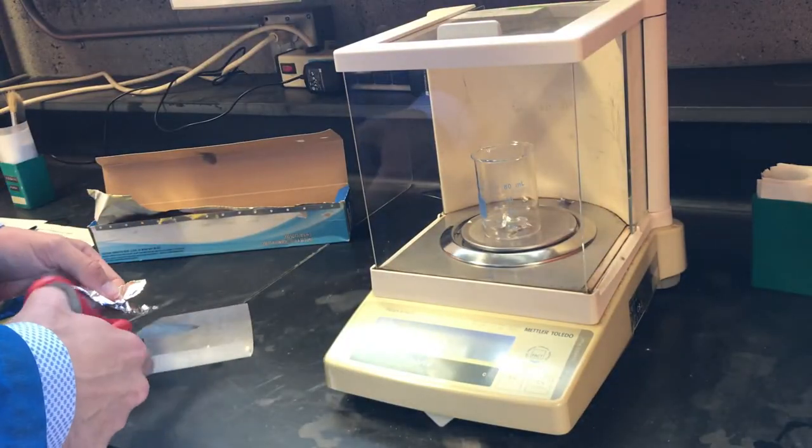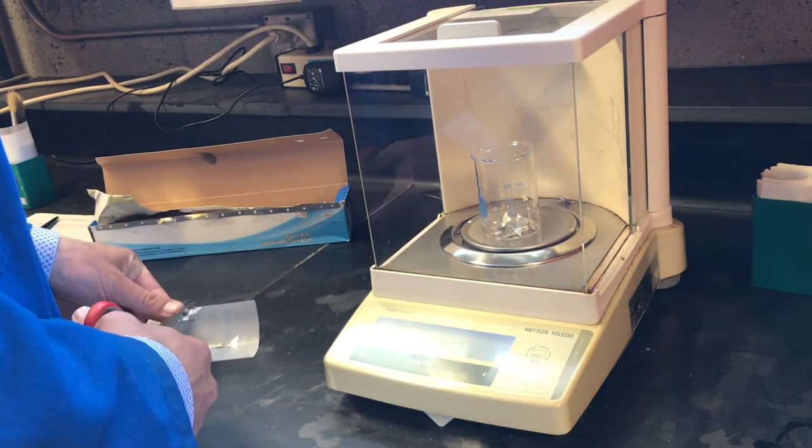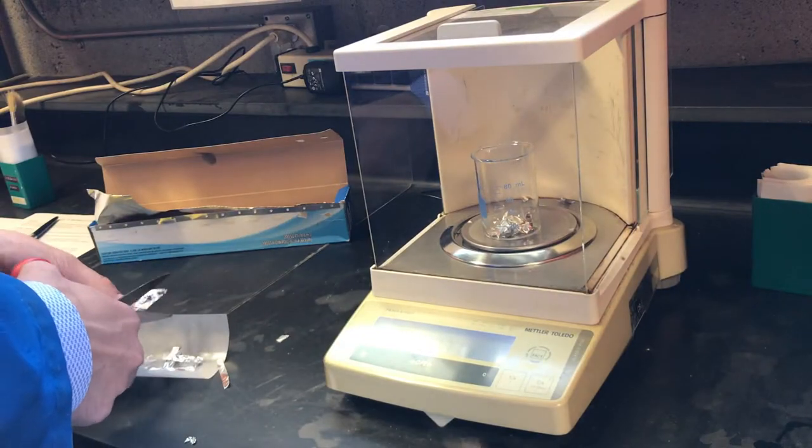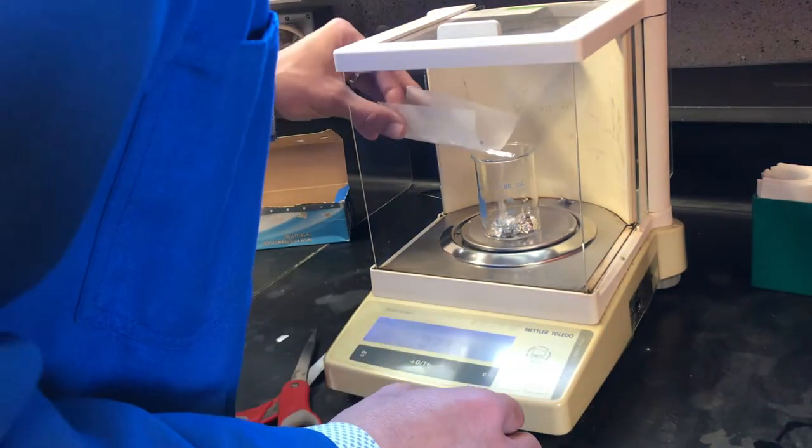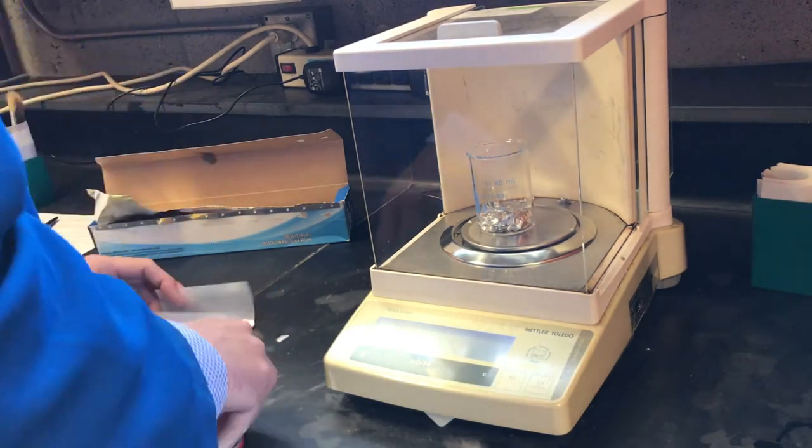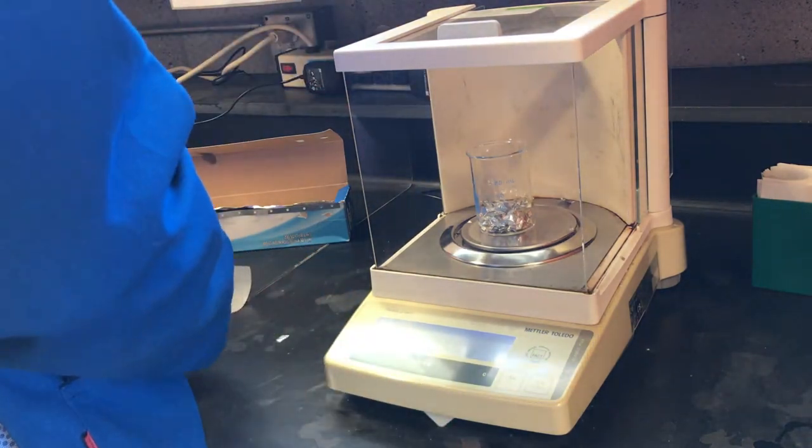We'll cut the foil to improve surface area to accelerate the next step in which we dissolve the aluminum metal. The starting mass of aluminum foil is 0.499 grams.